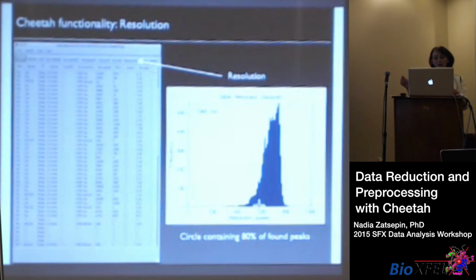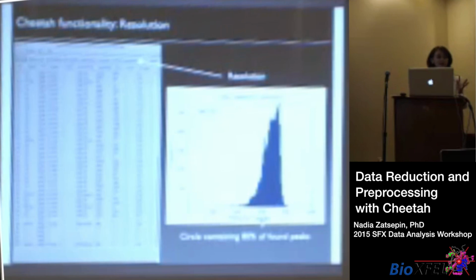Sample got really good at the end there. Now, as I said, it does an estimate of the resolution. This is a function of pixels, but quite easy to calculate in action, of course. So you can see that most of the patterns were roughly around the same resolution.